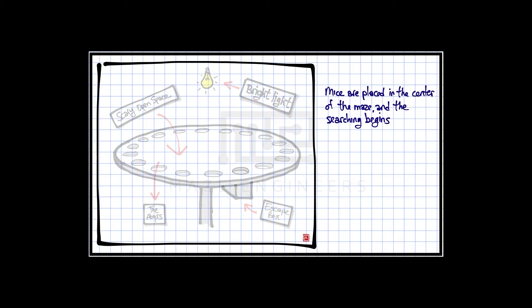Mice are placed in the center of the maze and the searching begins. External and internal visual cues may be used to aid the mice. Errors are made when mice check out non-escape holes.